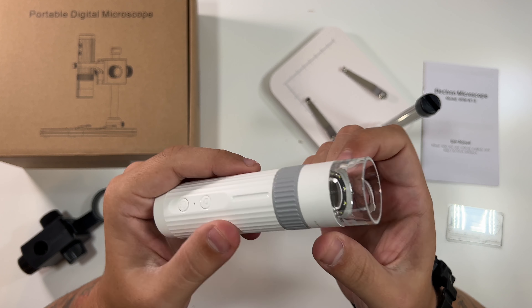Now that the device is powered on, we remove the little cap and go into settings to switch to the DV20 USB camera. You can use the dial to bring the microscope up or down, and also use the zoom dial to zoom in and out. You'll see it go all the way up and all the way down — so now we need to bring it up and find something to magnify.